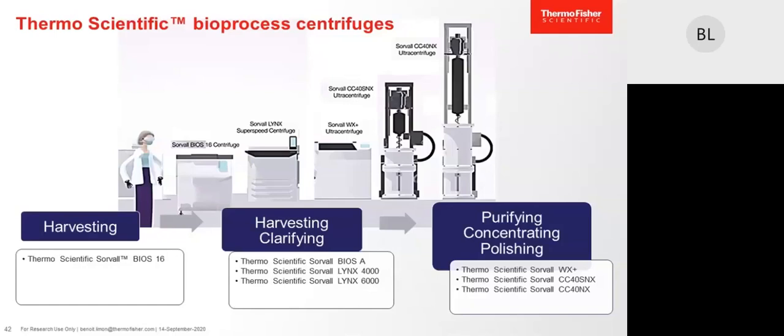The first technique, the chromatography, to separate the viral vector with the capture select based on the affinity, to isolate the full and empty capsid from the contaminant.